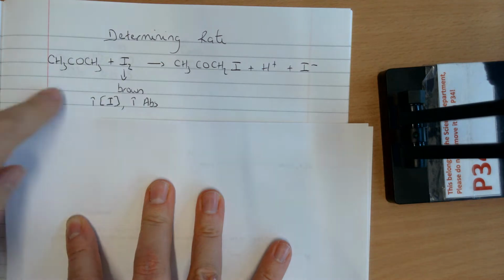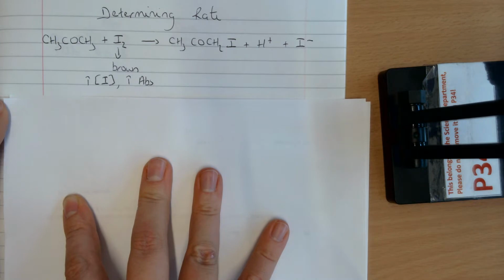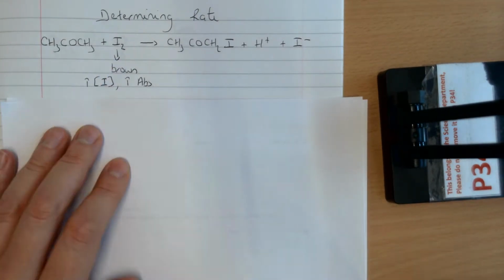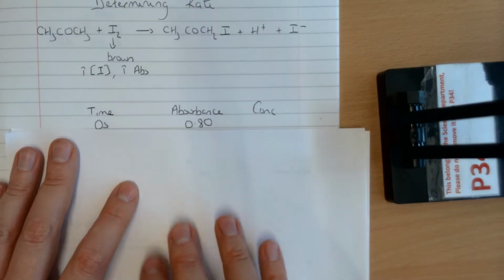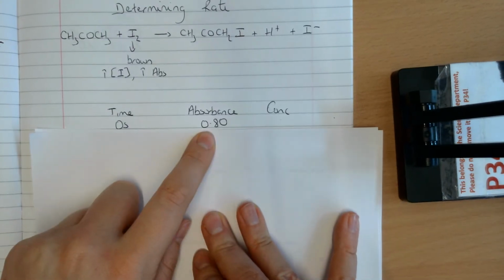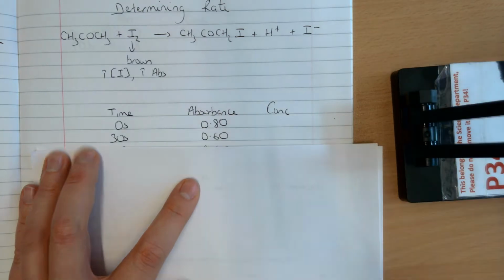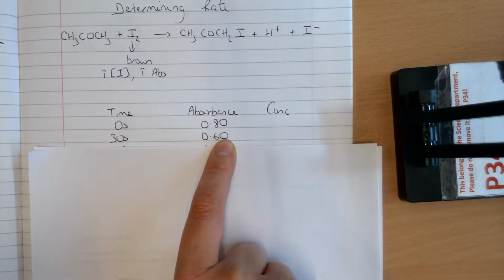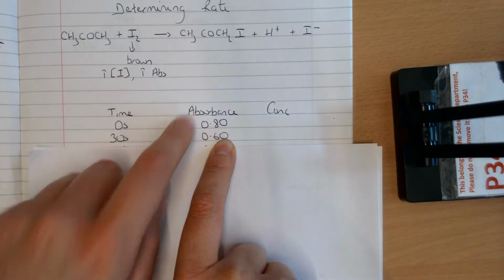So what you would do during this reaction, every maybe 30 seconds, you would take out a sample from the solution and you'd run it through your colorimeter. And let's just say at the start, before you started the reaction, at 0 seconds, you measured some of the sample and you saw that it had an absorbance of 0.8. And then 30 seconds later, you took another sample and you saw the absorbance had decreased slightly. And again, that's what I'm expecting. As the iodine is used up, the colour is going to fade and it's going to absorb less light.